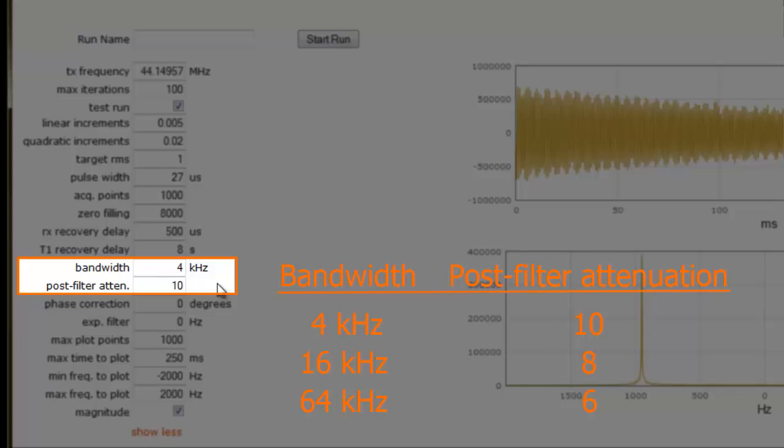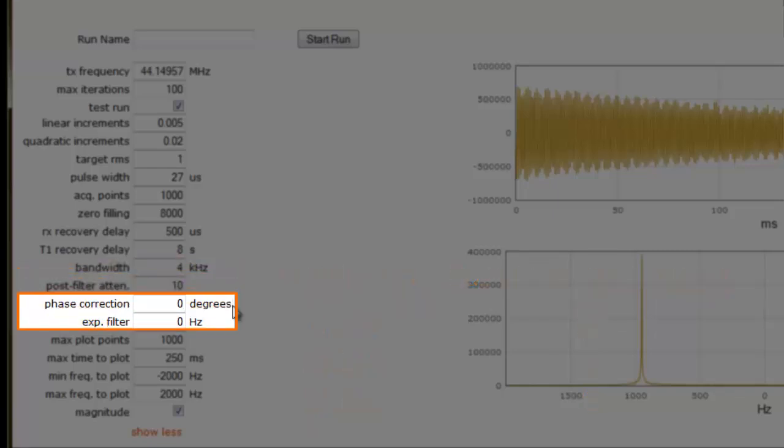As we saw in the zoom search video, when changing the bandwidth, one must also change the associated post-filter attenuation setting. The phase correction and exponential filter parameter fields are set to zero. We don't use either of these parameters for shimming.